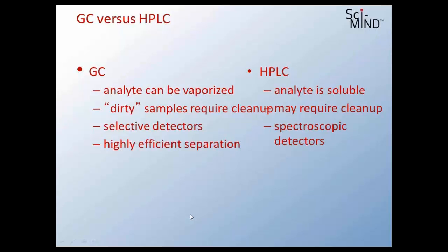It's interesting, in previous short courses, actually, in all of Professor McNair's former HPLC or GC short courses, they talked about you need compounds that are volatile. Think about this for a moment, a little homework for you. Ask yourself, if I asked you what a volatile compound is, or name a volatile compound, how would you reply?